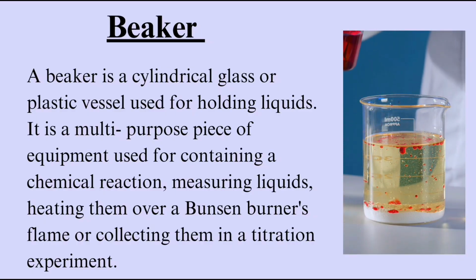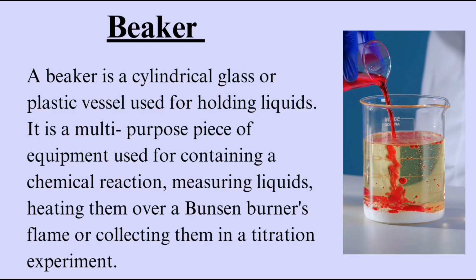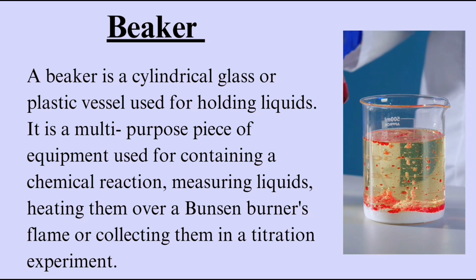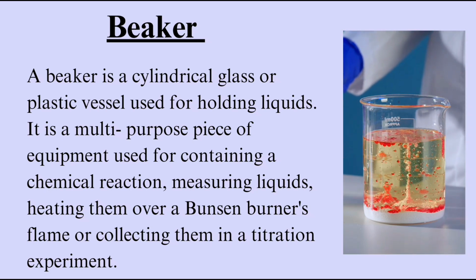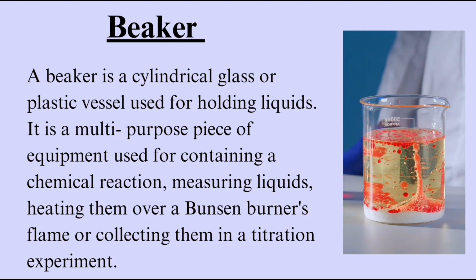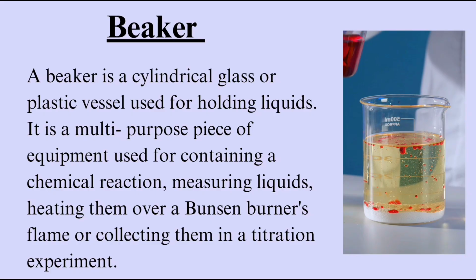Beaker. A beaker is a cylindrical glass or plastic vessel used for holding liquids. It is a multi-purpose piece of equipment used for containing a chemical reaction, measuring liquids, heating them over a Bunsen burner's flame, or collecting them in a titration experiment.